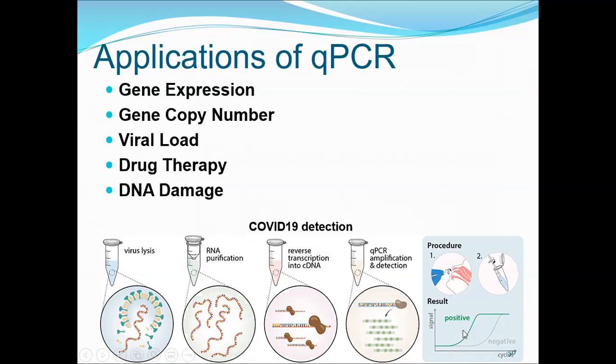And if you see an early peak, then this is a positive case, COVID-19 positive. And the whole procedure takes around 6 to 7 hours in standard conditions.